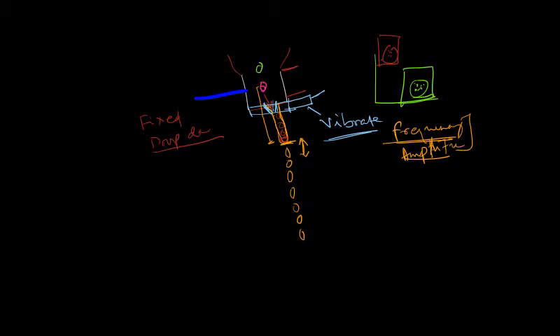How do we deflect the cells into the desired direction? If I want to collect the green cells, the cells bound to the green fluorescent molecule, and then we have cells bound to the red fluorescent molecule, and I want to collect the red cells to the right and the green to the left. It's not that green always has to go to the left, I can reverse it depending on how I select.